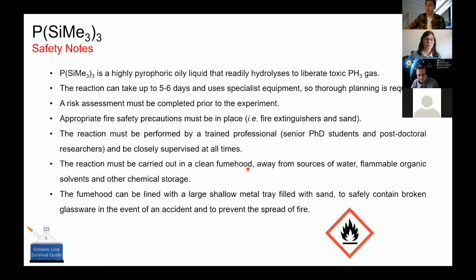Of course, it must be carried out in a clean fume hood, so I'd recommend removing all sources of water, flammable organic solvents and other chemical storage. And another preventative measure to improve the safety is to line the whole fume hood with a metal tray which is filled with sand, so that can contain any glassware in the event of an accident and help prevent the spread of fire.